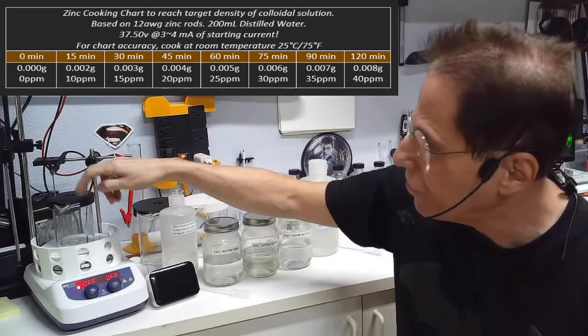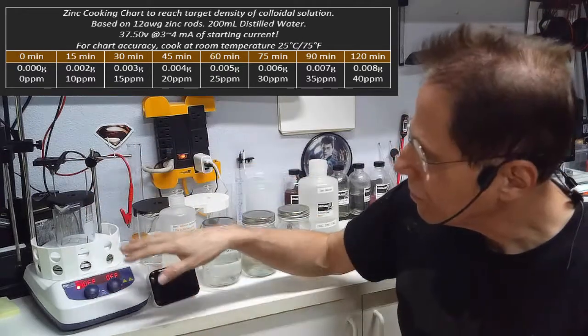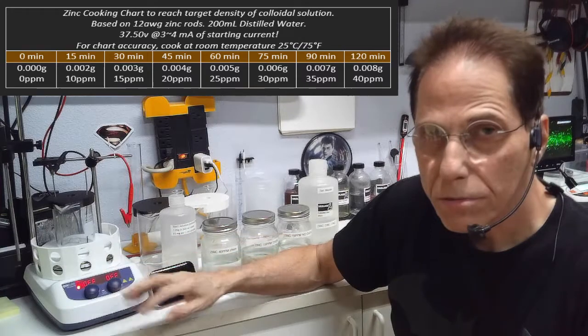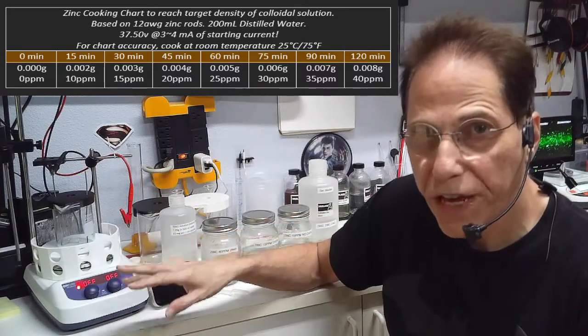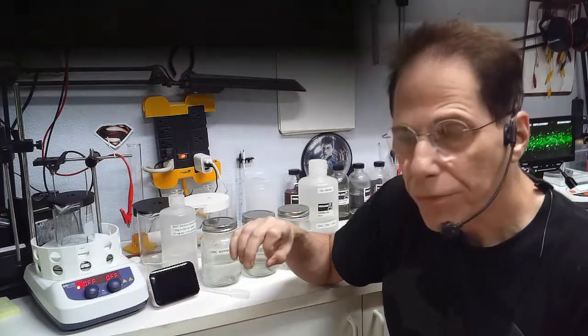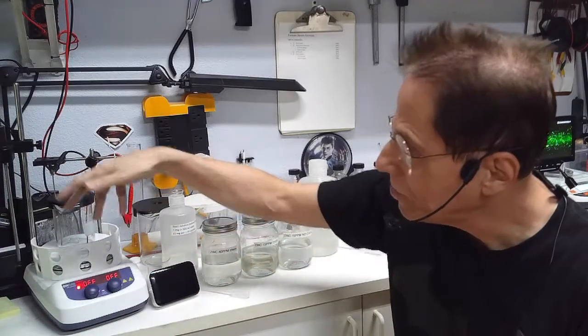Whatever time it says for 200 to cook to 15 or 20 parts per million, just double that if you've doubled the amount of liquid. Don't use any heat. I use heat because it makes it go faster, but if you don't have a heated stirrer and you can't measure the weight of the rods, you're not going to know how much zinc you have in the mix.